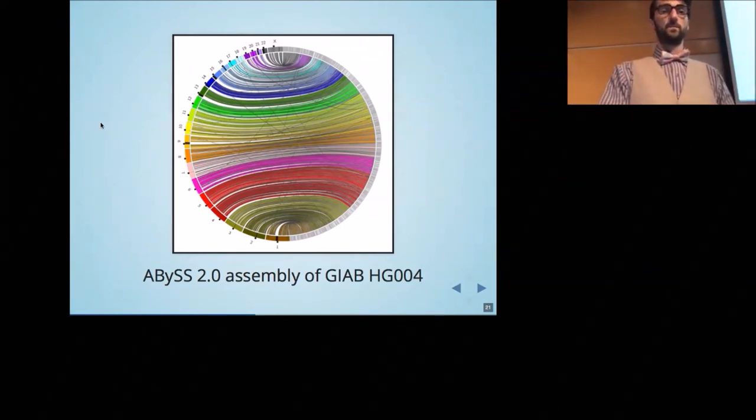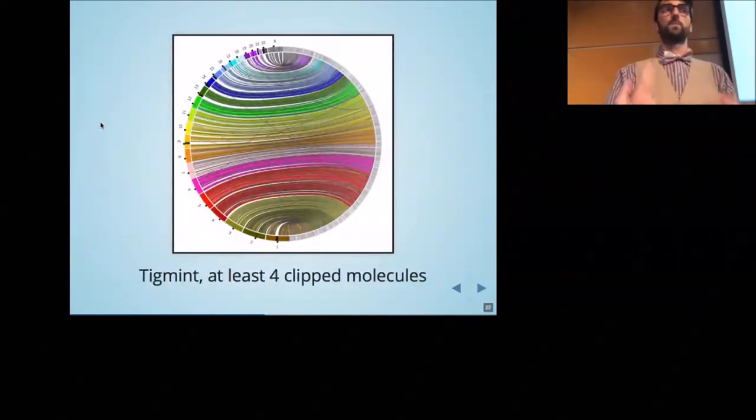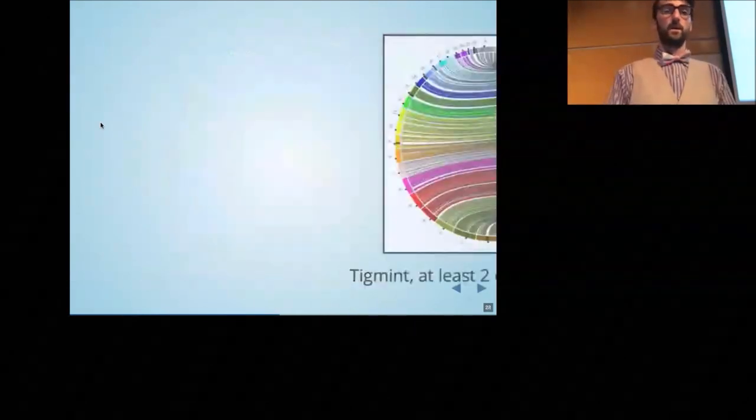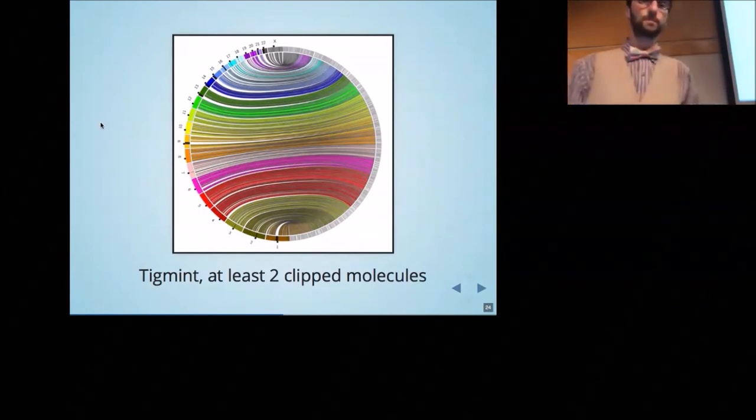This is the assembly before running Tigmint and after running Tigmint. A number of these misassemblies—these translocations—are corrected. By adjusting parameters to make it more sensitive, we can eliminate even more of these misassemblies, and eventually all of these translocations are eliminated. So the tool is working well.